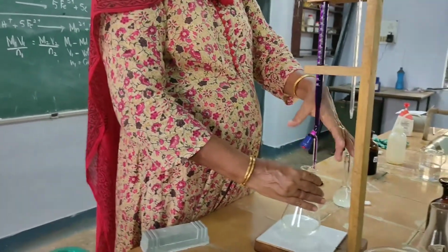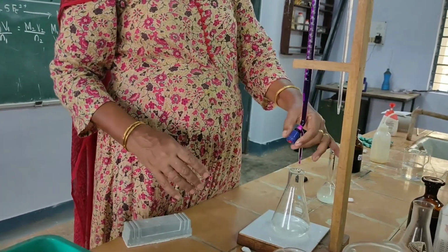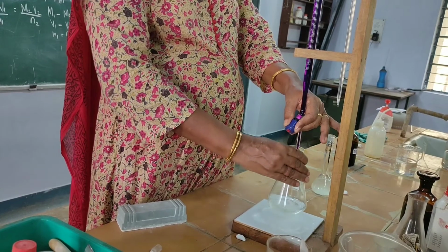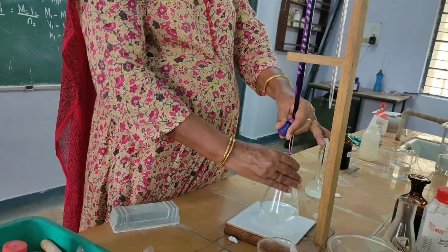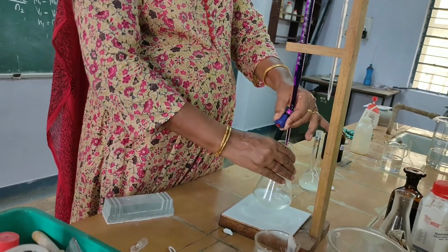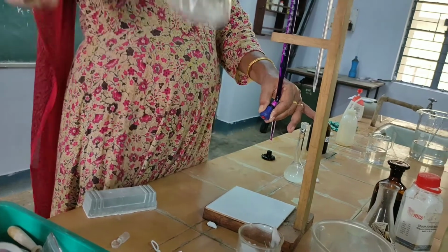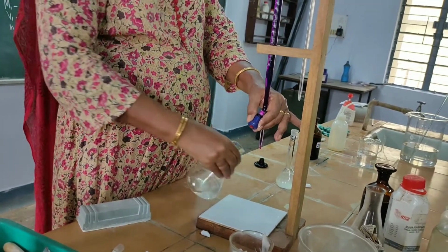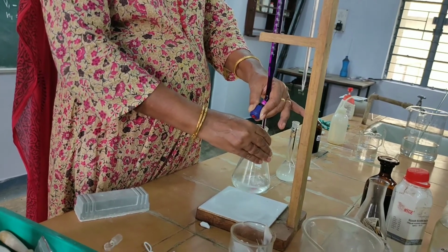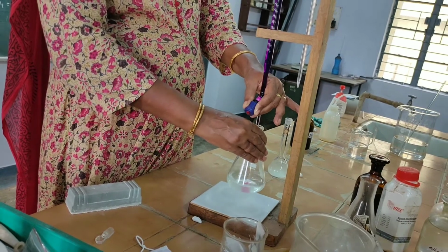See how to hold the burette. You see, I am keeping it here with the left hand. You hold it like this. Then with the right hand you hold the conical flask, like this. See, all the color is disappearing. No color, till you get the permanent pink color. I am using a white background so you can identify the color easily.